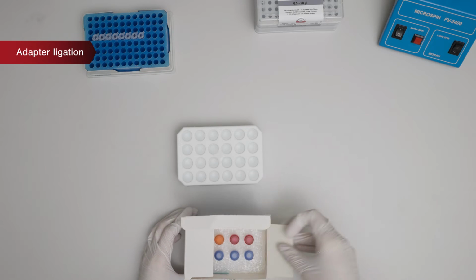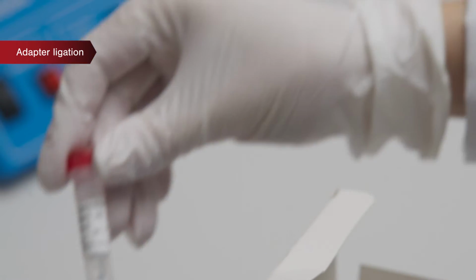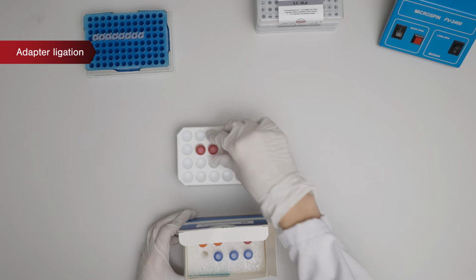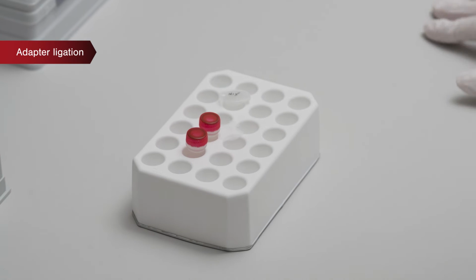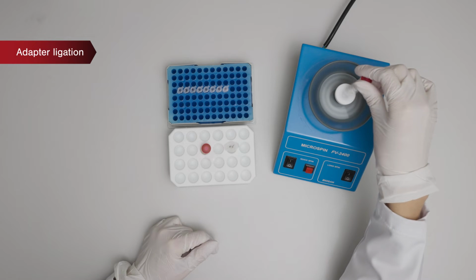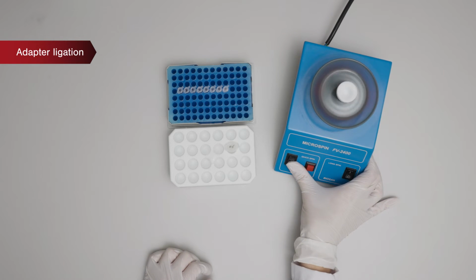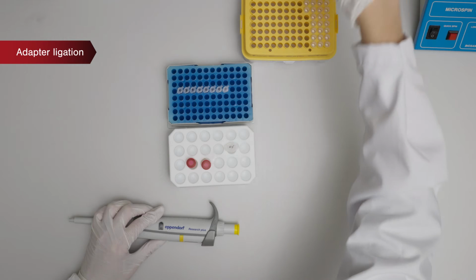To make a ligation mix, it is needed to combine 23.4 microliters of ligation buffer with 1.6 microliters of DNA ligase for each sample. While preparing a ligation mix, it is important to remember to pipette very slowly due to the viscosity of the ligation buffer, and to place reagents and samples on ice. When 5 microliters of adapters and 25 microliters of ligation mix are added to the reaction mix, samples are vortexed 6 times for 3 seconds each time and centrifuged.